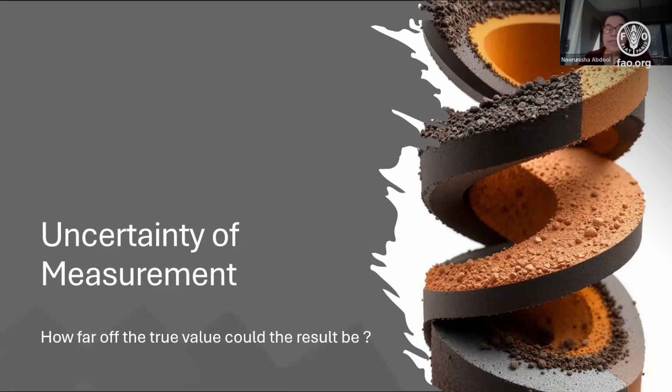There are so many ways to do uncertainty of measurements. There are so many factors to take into account. I'm going to show you 4 ways to do it, and the one I prefer most and why. And like I say, be open to the fact that this may not always work for your laboratory. You have to do this according to the method that you are working with.